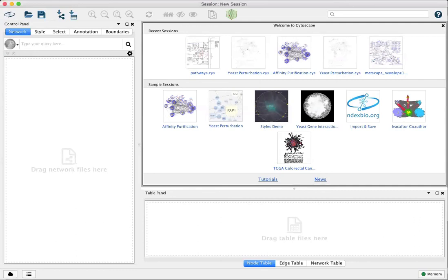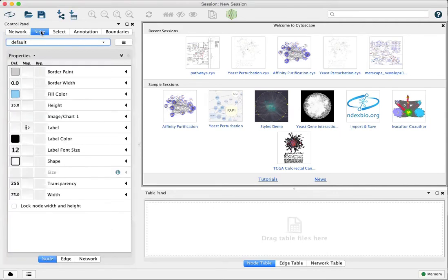This is Cytoscape 370 and I'm going to show some of the hidden properties available through visual styles. First go to the style tab in the control panel.